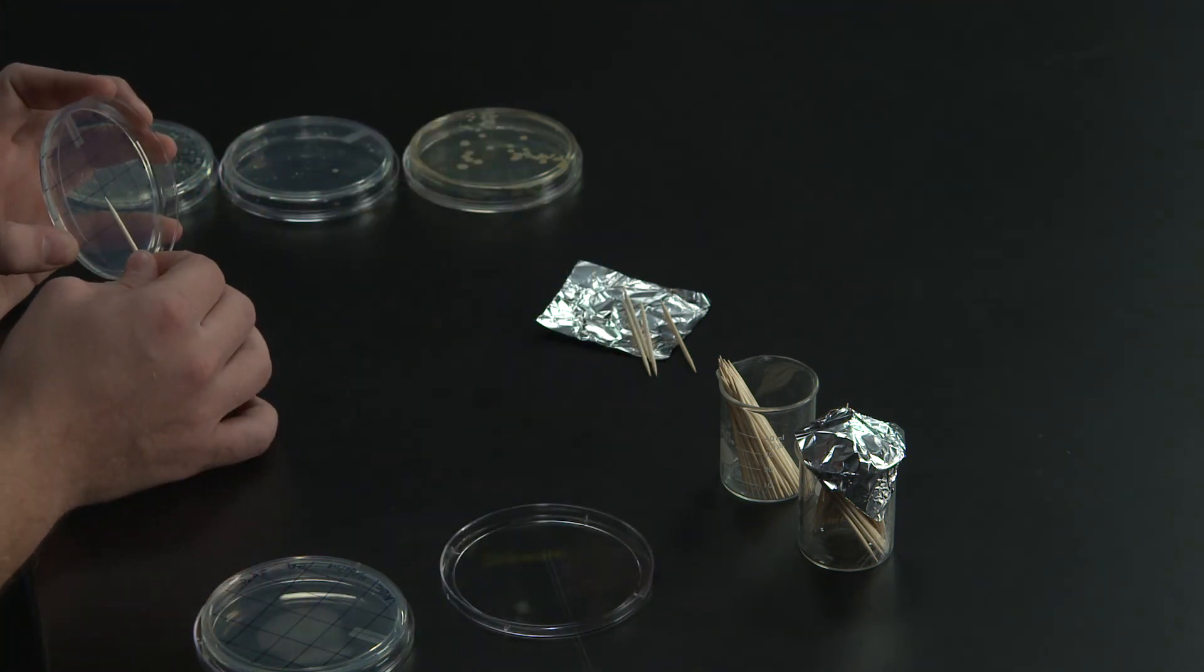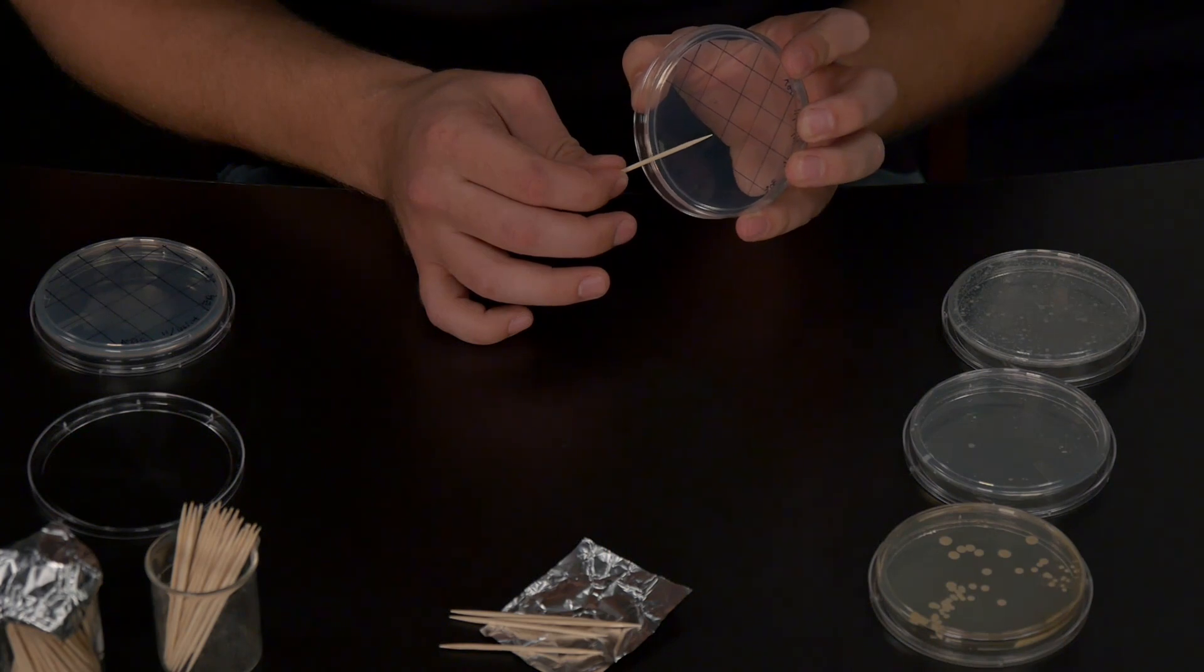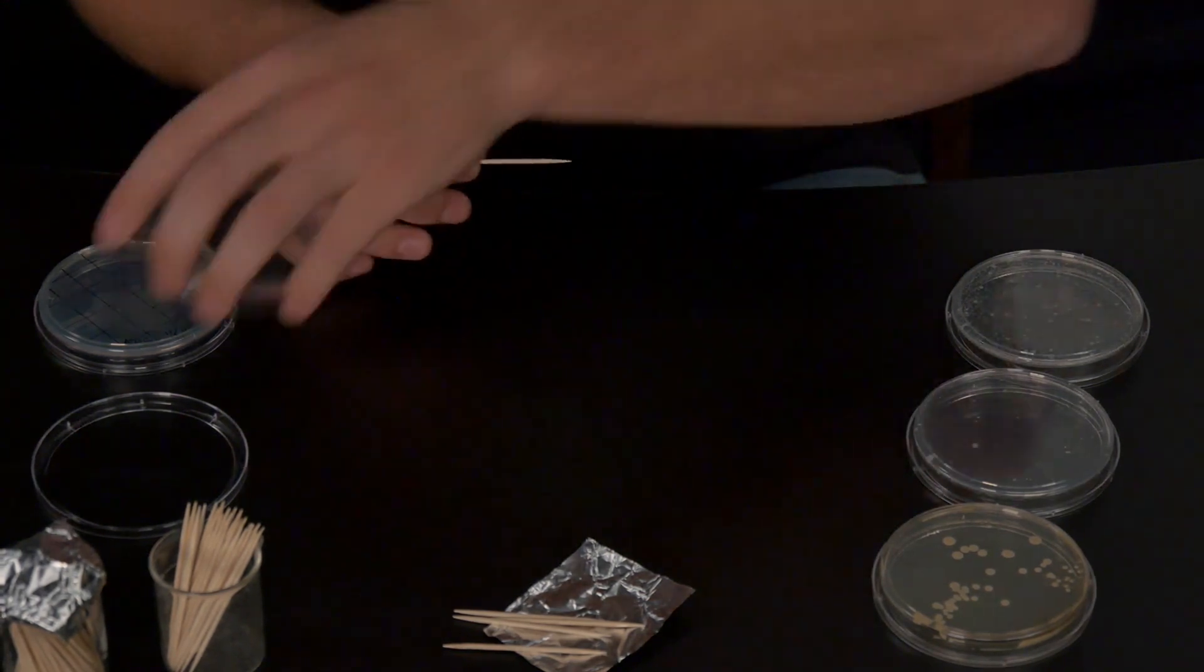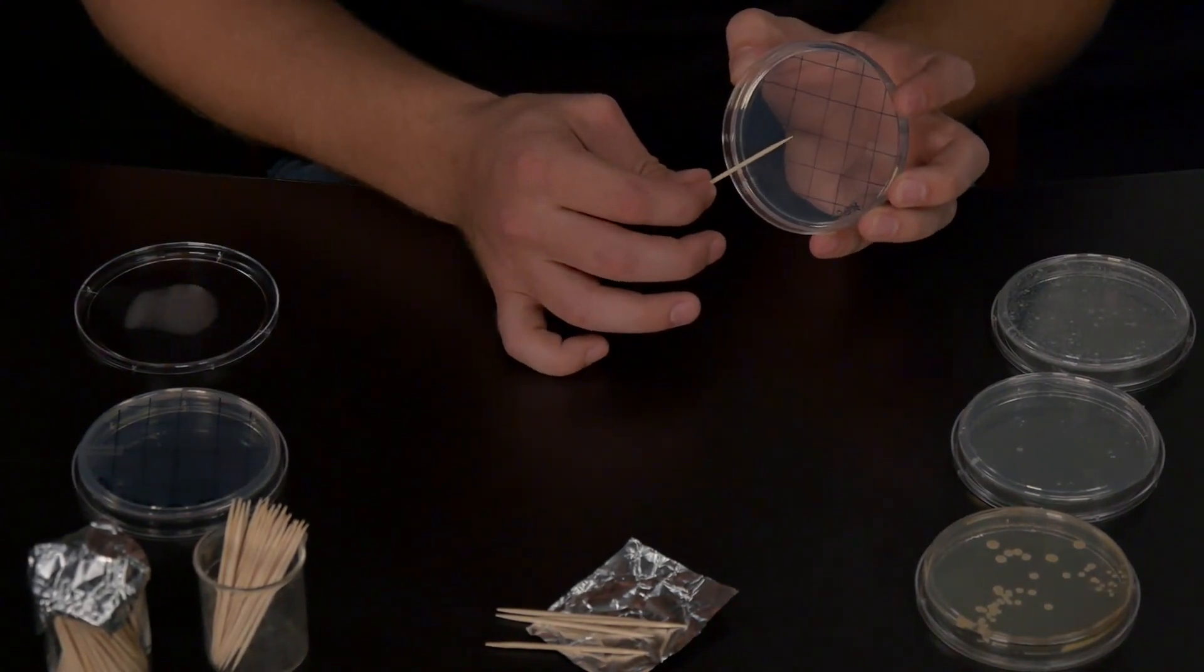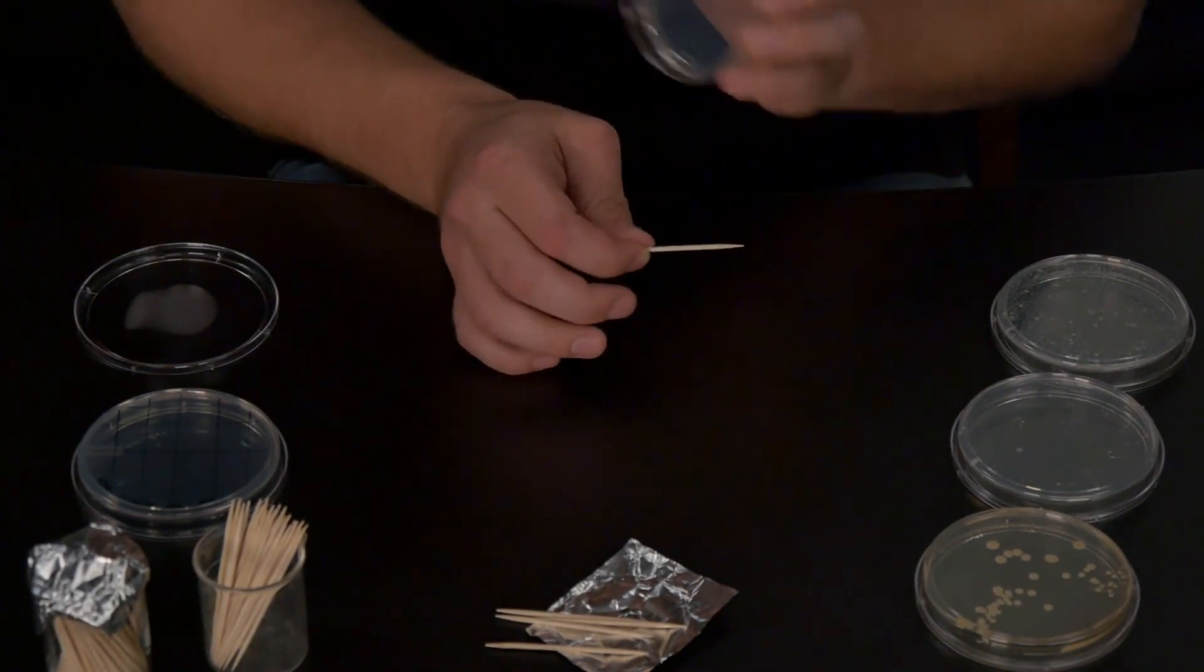As you spread the bacteria within each grid space using your toothpick, leave enough room for the bacteria to grow. Do not spread them too close to the edge of the grid for fear that they will grow into the neighboring spaces.